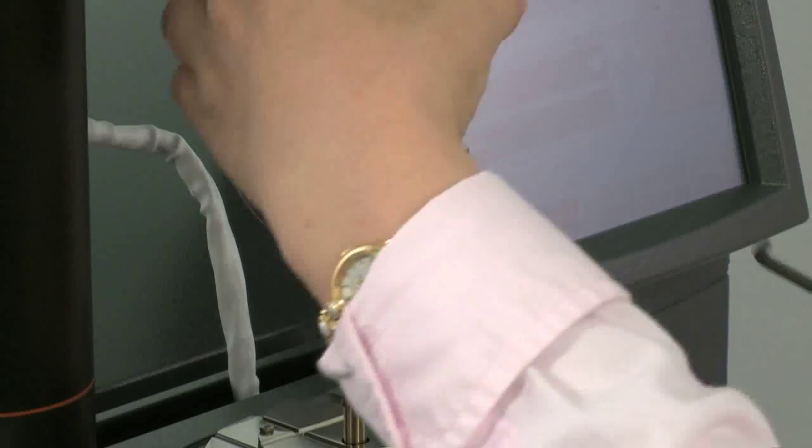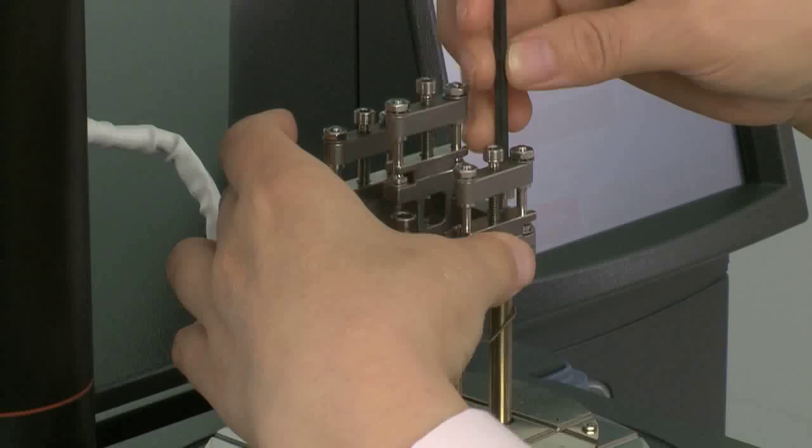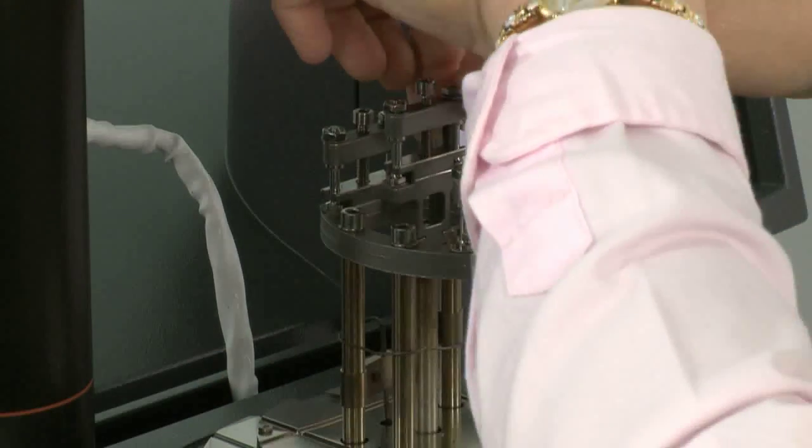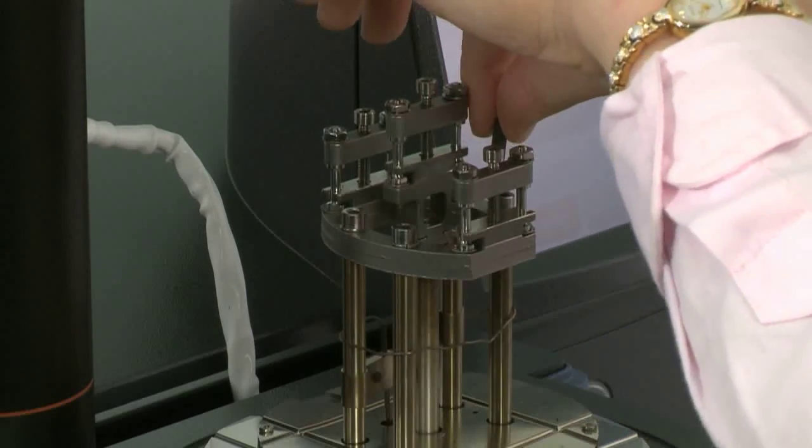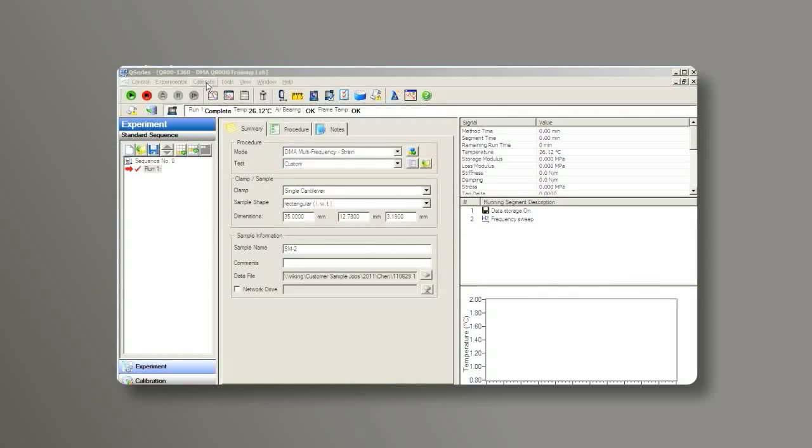Then install the stationary clamp. Tighten all the screws with the allen key that's provided in your clamp kit. Make sure not to bend the thermocouple.